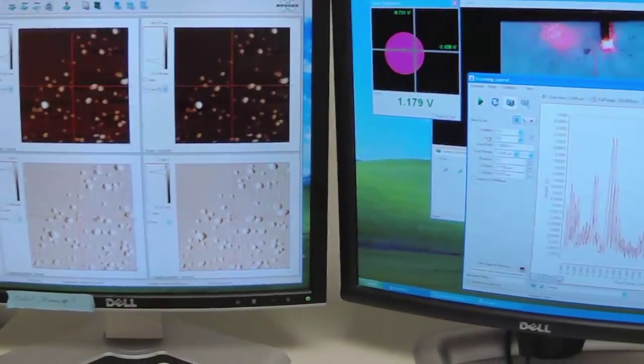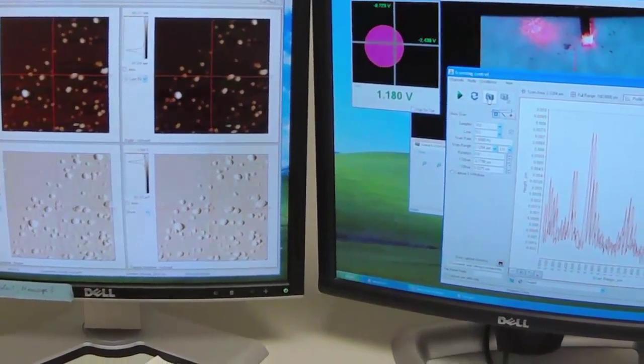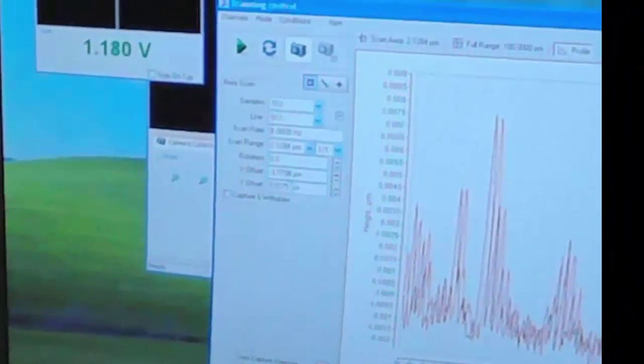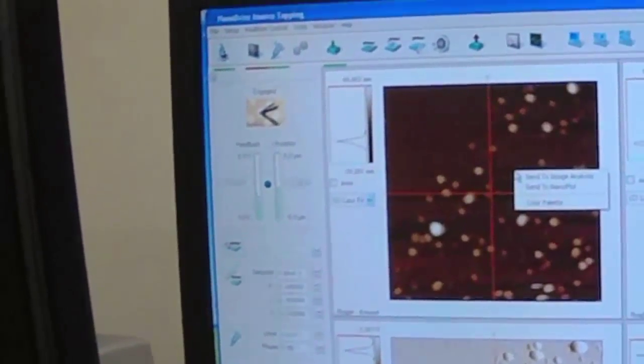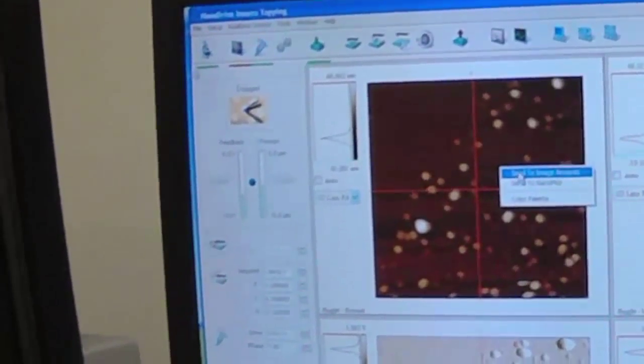There's two ways to do that. One way is to save the file to the data folder using the camera button here. Another way, we can right-click and it says Send to Image Analysis.